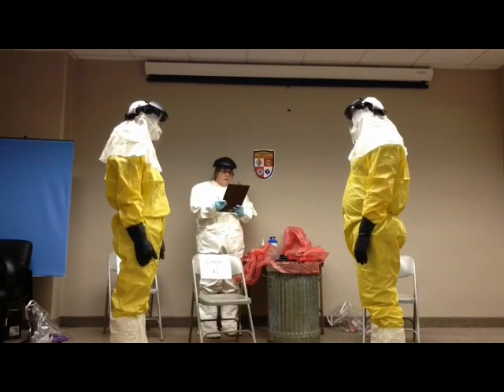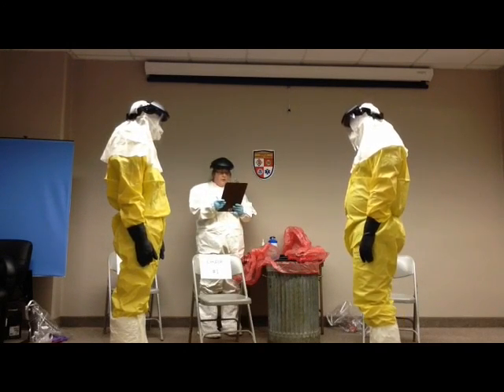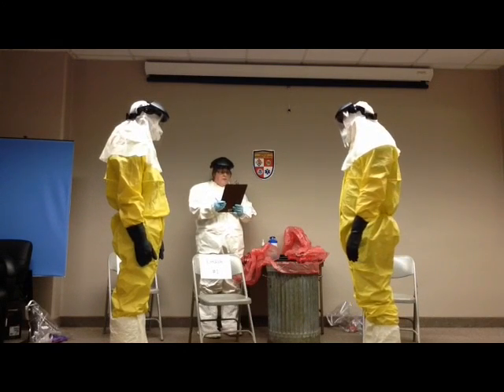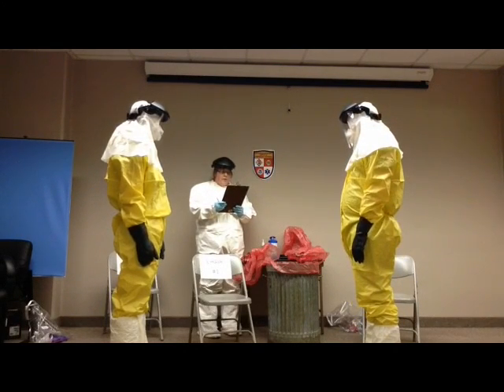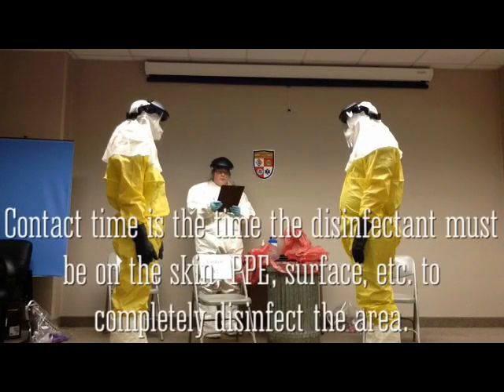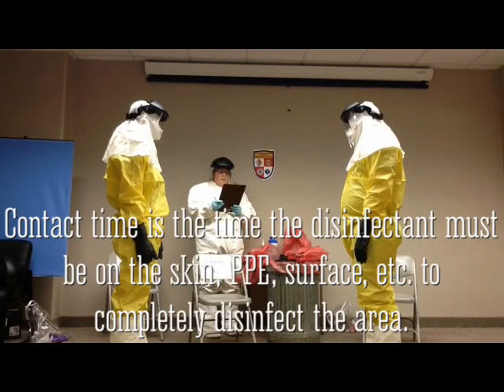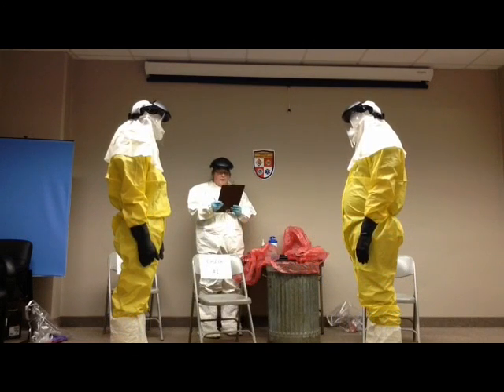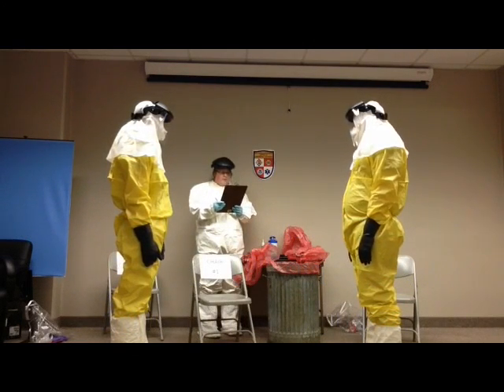Doff PPE in correct order, slowly, carefully, and methodically. When using alcohol-based hand sanitizer and disinfectant, be sure to allow for proper contact time for disinfecting. Contact times must be ensured between each step to allow for any potential virus to be killed completely. A reference for contact times can be found at the bottom of this checklist.